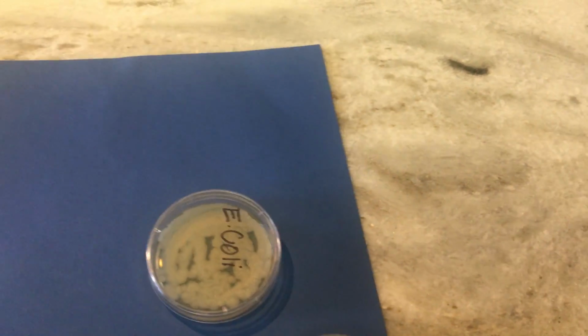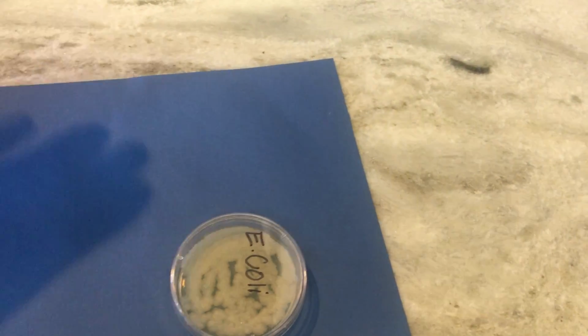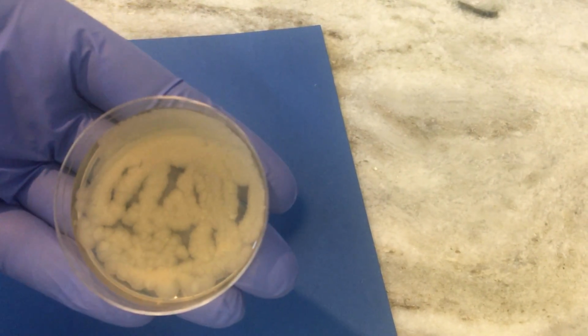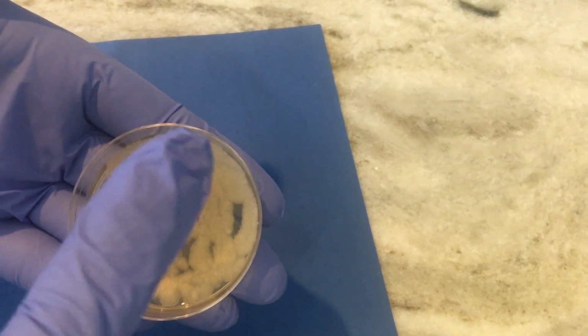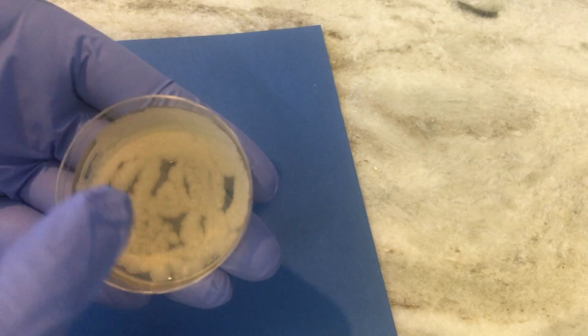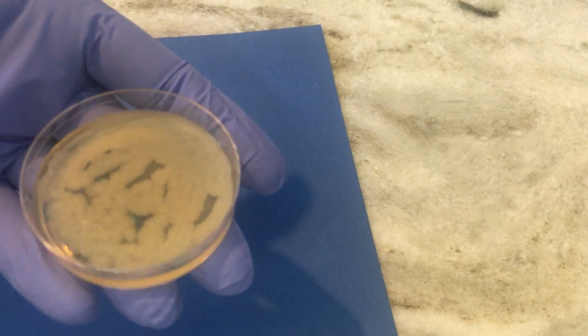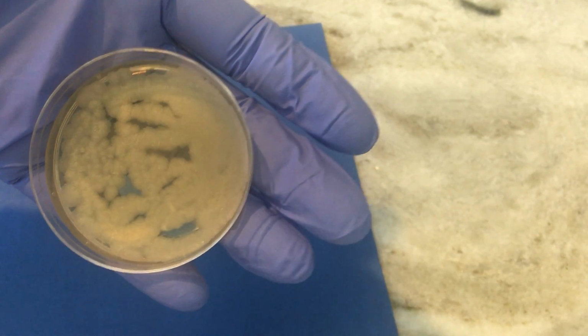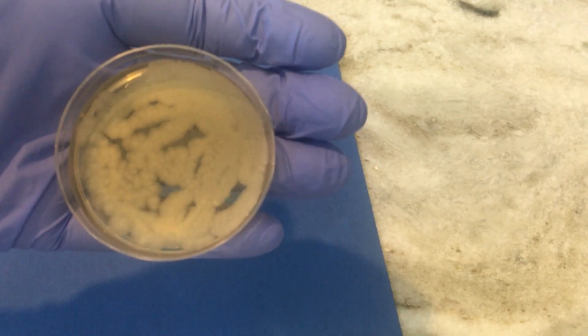So we'll go down here, and I'm going to pull this over, and I like using dark paper so you can see. So if you see my E. coli here, you can definitely see the growth. There's growth all around there. So the pattern is not like the instructions. I wanted to go heavy here and then spread out and then get lighter and lighter. Well, maybe I wasn't the best at that. I did say in my essay it was hard to see where I had zigzagged. I need to be more attentive to that. But there's definitely growth there, right?